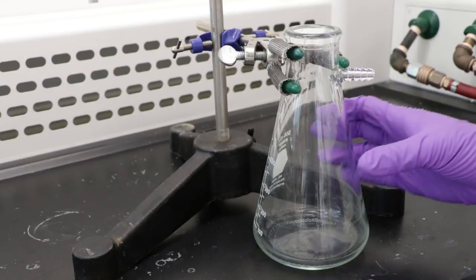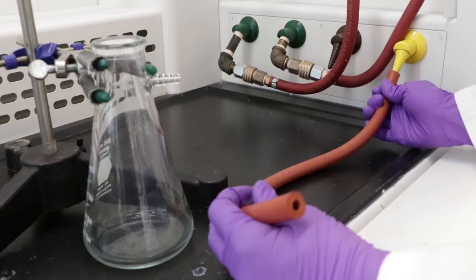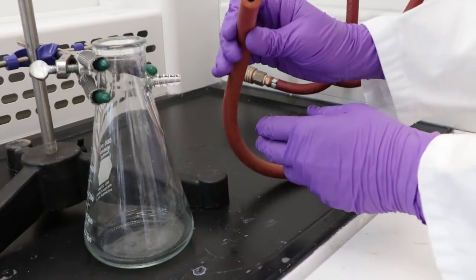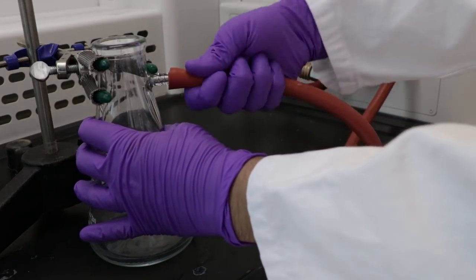Make sure the flask is attached securely. Attach the orange tubing to the yellow vacuum tap. Then attach it to the vacuum flask. Twist to make sure it's on tightly.